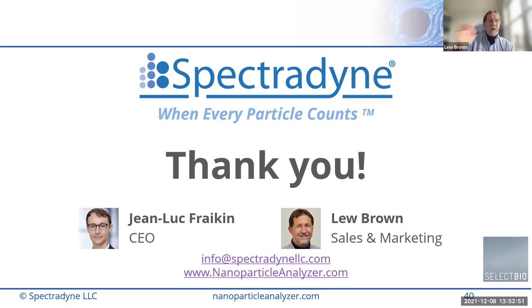Wanted to jump in and add on that also. As Jean-Luc mentioned, our raw measurement is actually particle volume, and that's irrespective of what shape the particle is. That's quite different from optical techniques, because optical techniques have to assume that all particles are spherical.